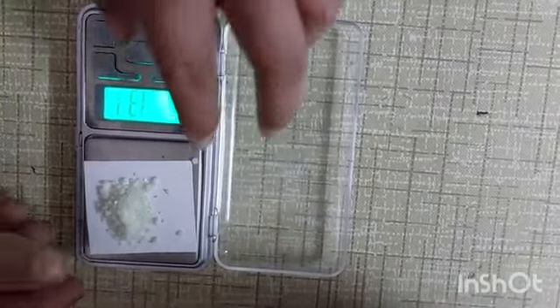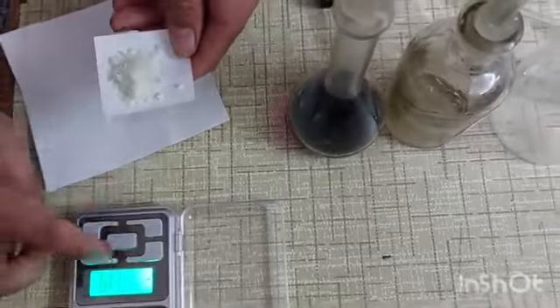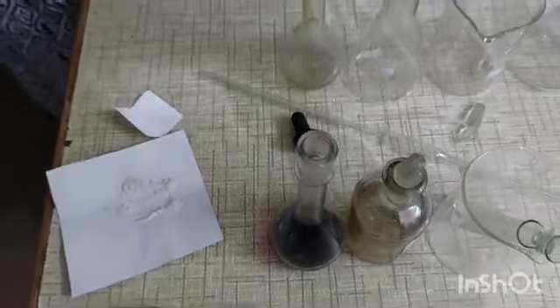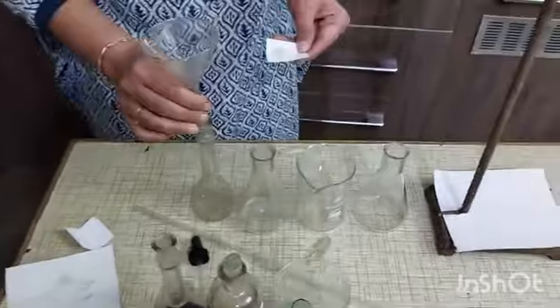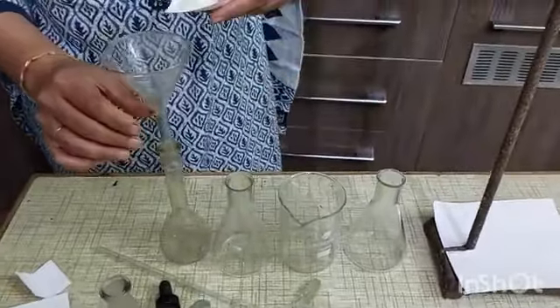Now this salt is transferred into a clean 100 ml measuring flask.